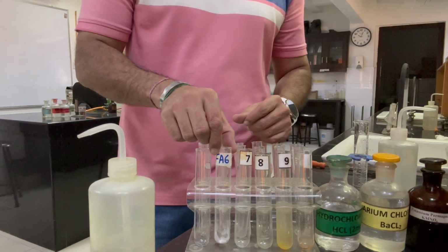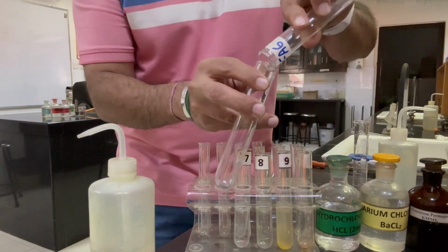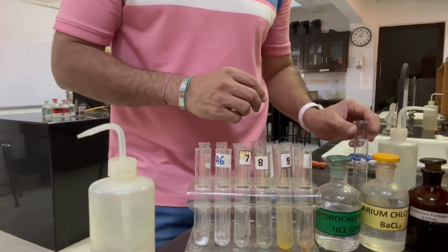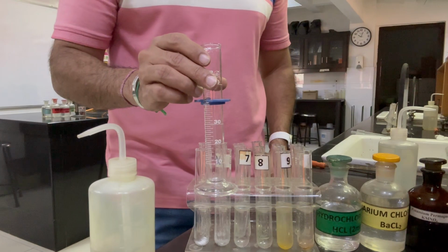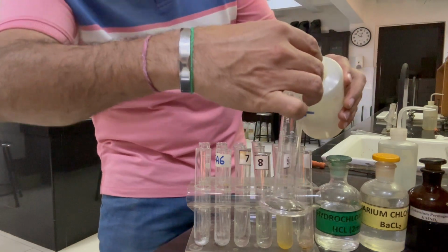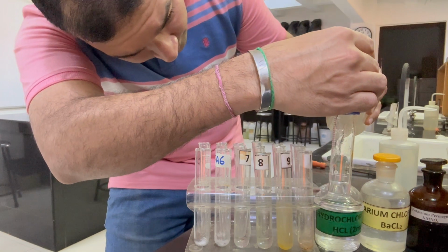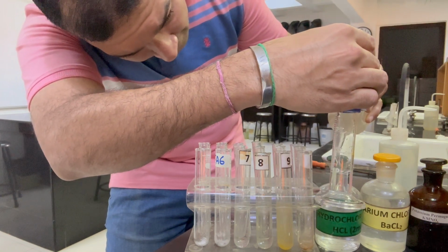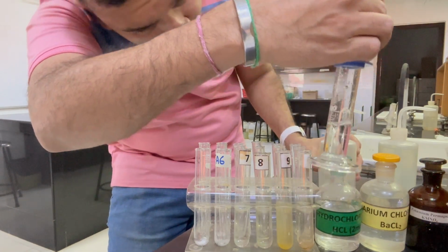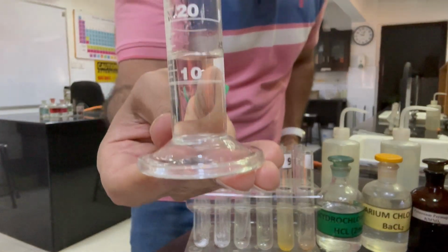Now I will take the given Fa6 in a boiling tube and I will add 15 cm³ of distilled water. For that I will use a measuring cylinder. I will take 15 cm³ of distilled water in this measuring cylinder. Now it's approximately 15 cm³ here.